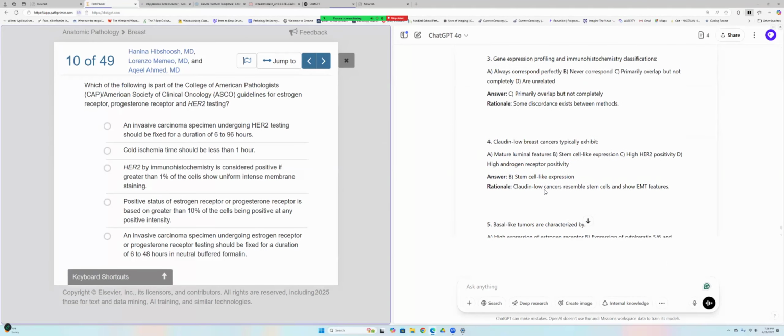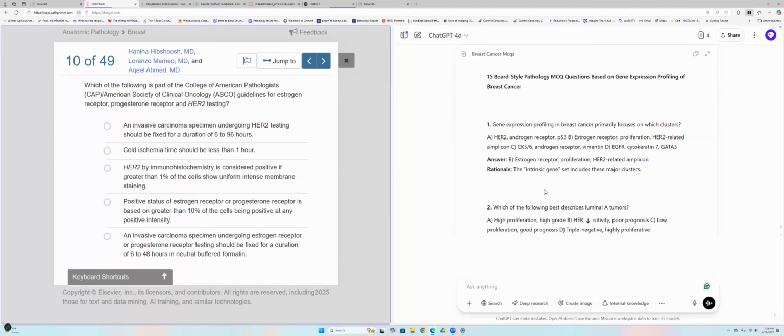That's the ideal, though. That's the normal thing to do. Before you put it in formalin, you don't put the whole breast cancer inside formalin. You have to prepare it. Do you normally cut it into tiny bits and ink it before you put it in? No, the lab supplies the formalin buckets depending on the surgery type.